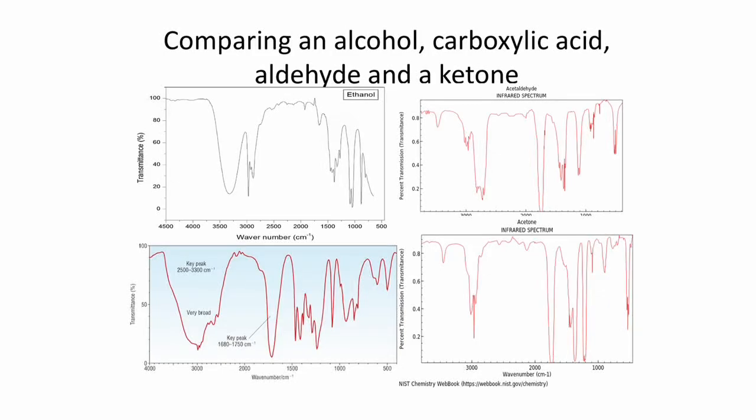Today's video, I'm just going to be looking at the question that we went through in class, and this was based on your IR spectroscopy. Just to recap, during our covering of your IR spectroscopy, we're looking at your spectrograph, which shows the different wave numbers associated with your specific functional groups.